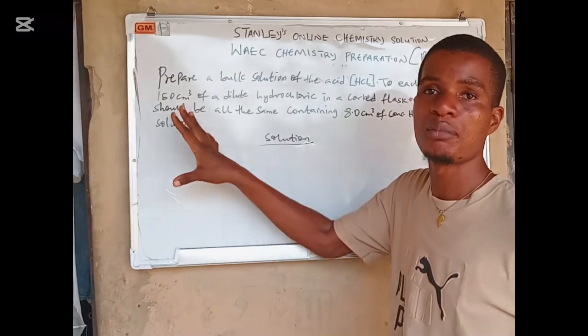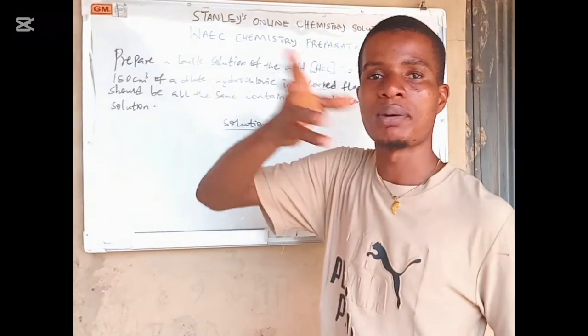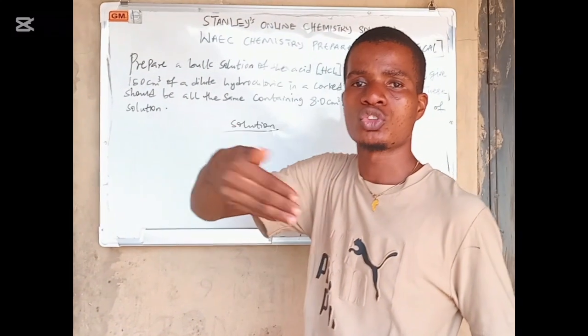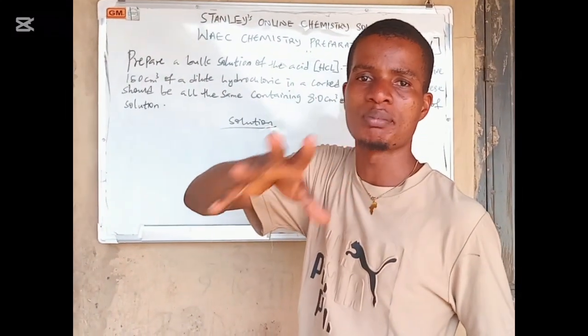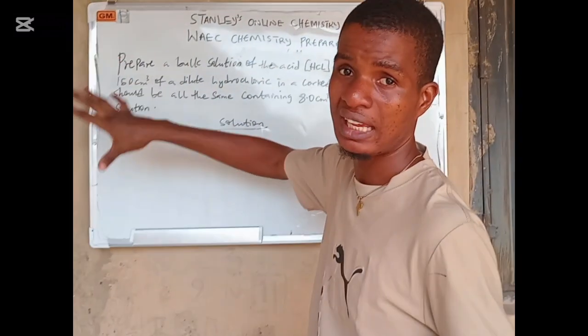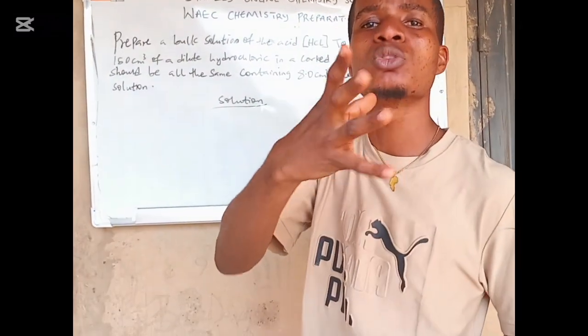Now, I formulated this question, right? Where I used to send white paper to teachers to instruct them of the kind of question that they will write, right? And what they need to prepare. So I formed this question now in line with what they used to tell teachers, right? So that you know how to do these things.